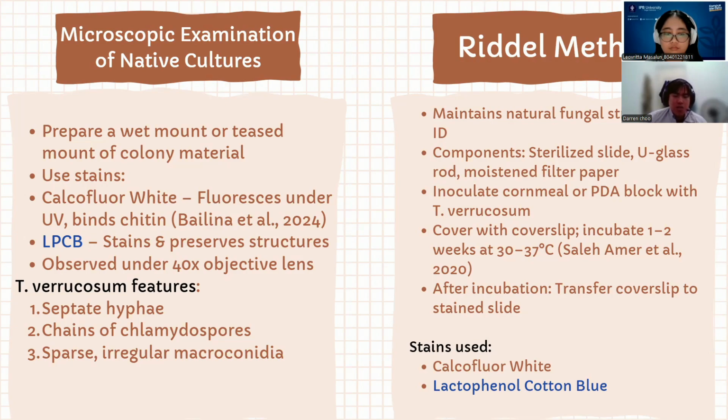Using the 40 times objective lens, we look for characteristic traits for T. verrucosum, which will be discussed later.